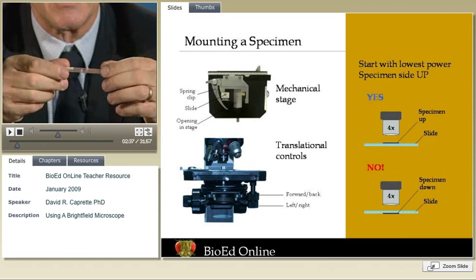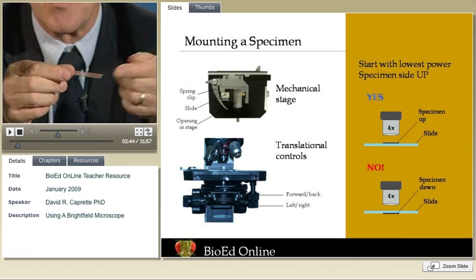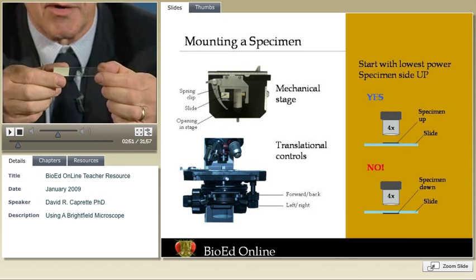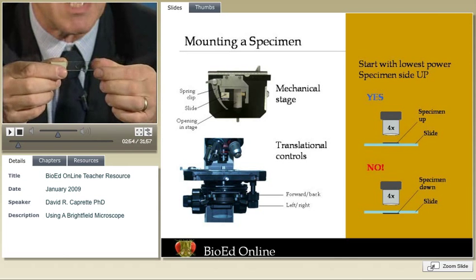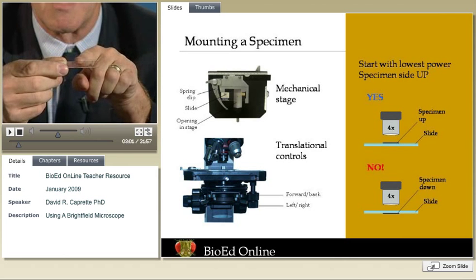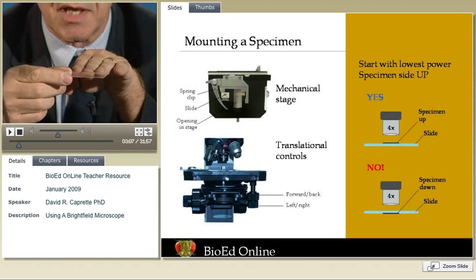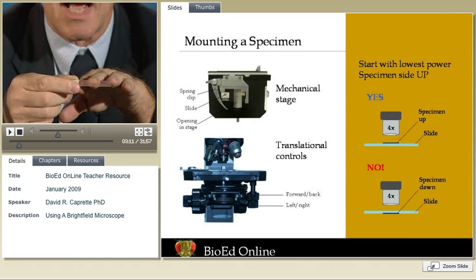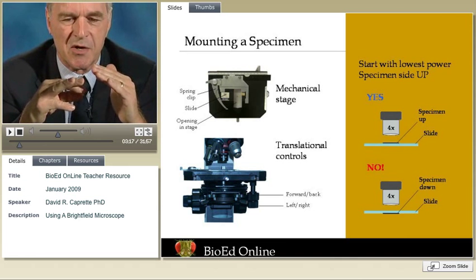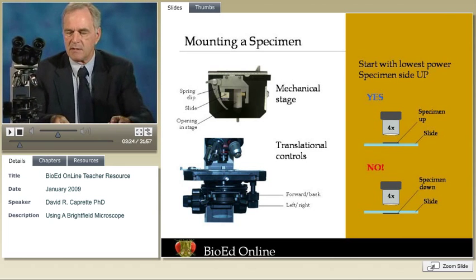With bacterial smears, it's critical that we know which side is up. If the slide's upside down, you can see perfectly well through the glass slide at low magnification — probably at 40 power, probably at 100 power. But go up to 400, and you're going to go right into the slide and possibly break it trying to focus. The other reason for having the specimen up and using a very thin cover slip is that you have very little glass between the specimen and the objective lens. If we're using specialized optics or trying to match the condenser to the numerical aperture of our lens, we don't want a thick hunk of glass distorting the image.